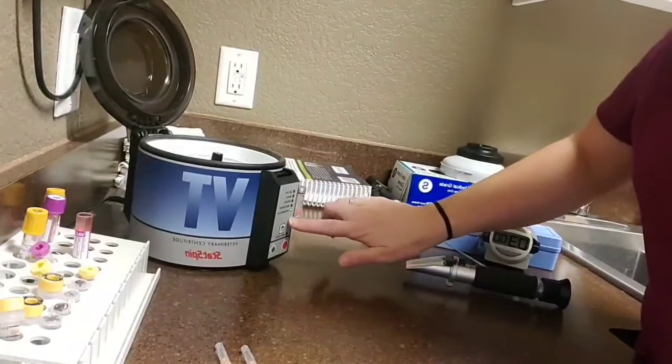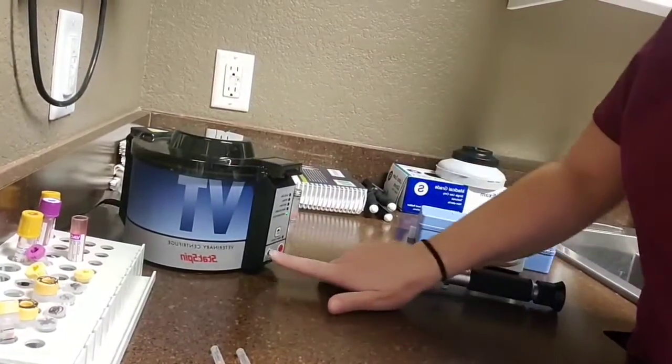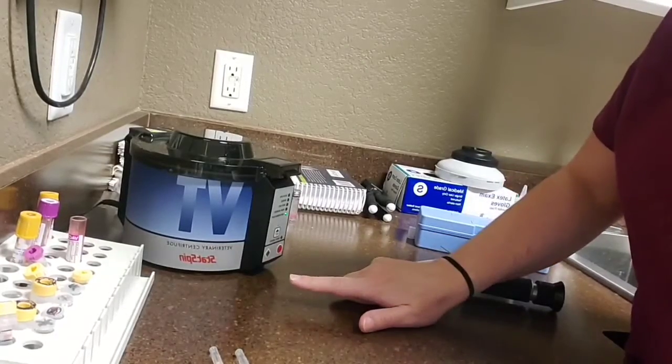We do want to make sure that it is set on microhematocrit, which is where I have it set. Make sure our lid is good and closed, and press start. Once this is done spinning, we'll come back and continue the rest of the test.